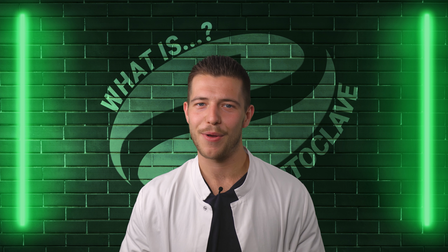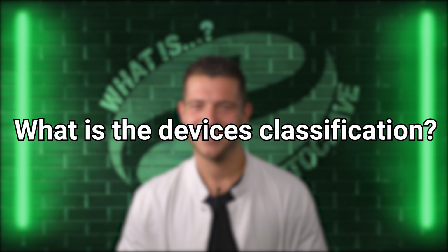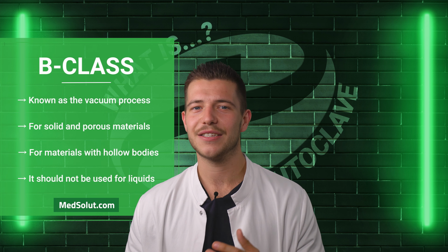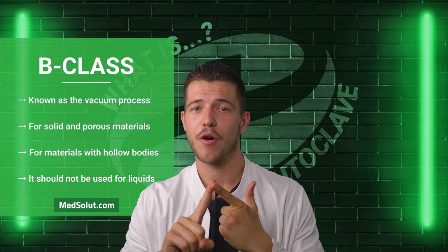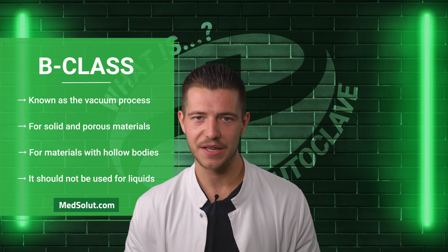And this is where we point to the second question. What is the device's classification? First of all, there is the Class B autoclave, which has got nothing to do with school grades, besides, as you may have already known. But the Class B autoclave is known as the vacuum method, and it is useful for treating solid materials, especially those offering porous materials and hollow bodies. You should not treat liquids with this one.